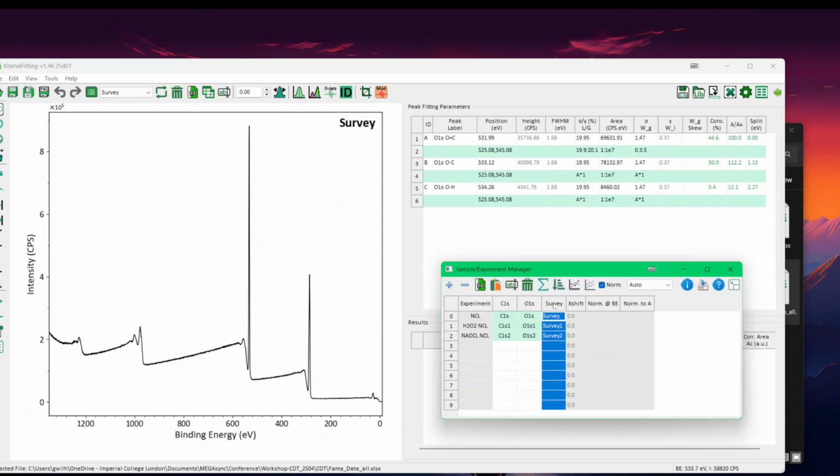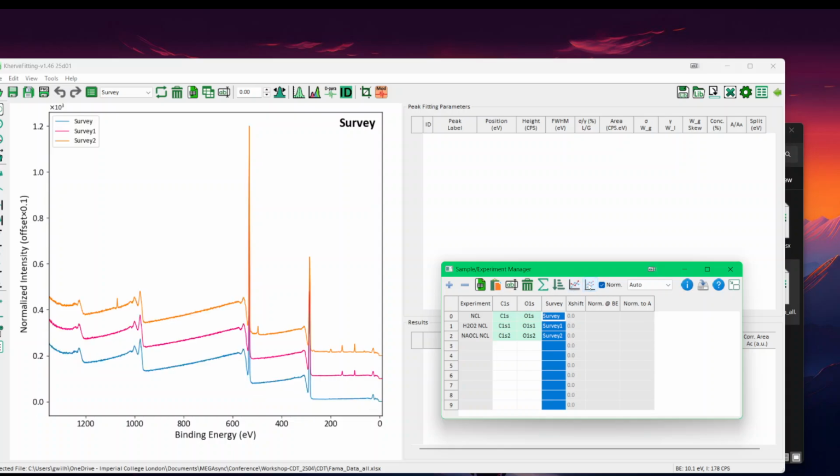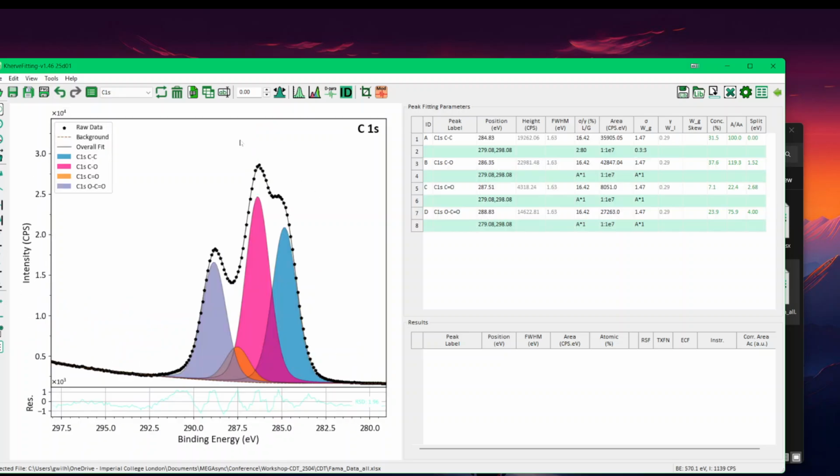I think they must be looking the same, as you can see, and maybe it's easier to see it like that. Just a bit of silicon on carbon. Yeah. And so now, let's say this is fitted here, and this is the first one.